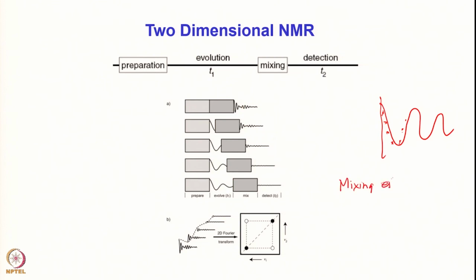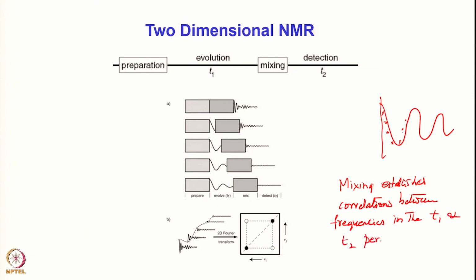Mixing establishes correlations between frequencies in the T1 and T2 periods.